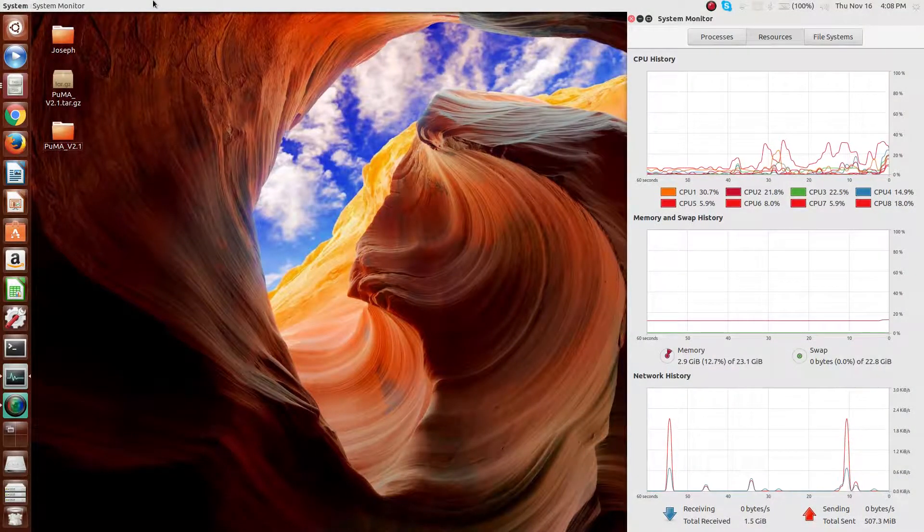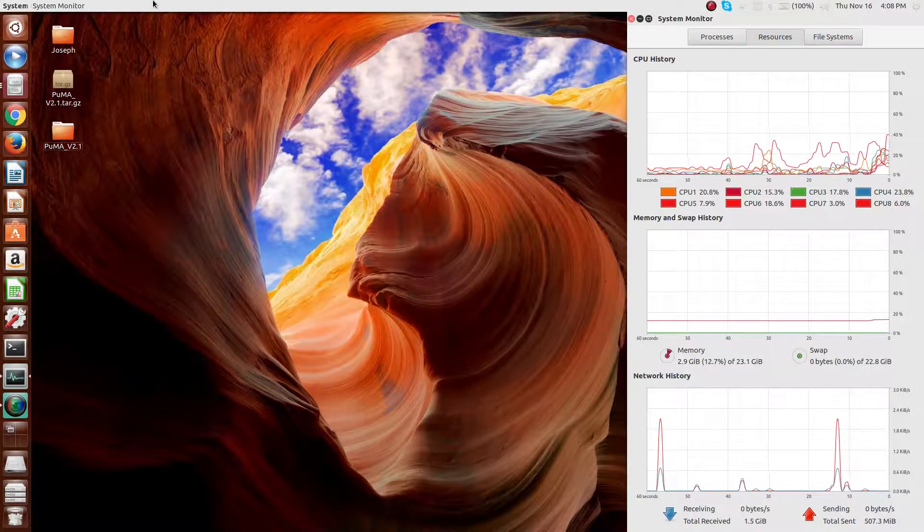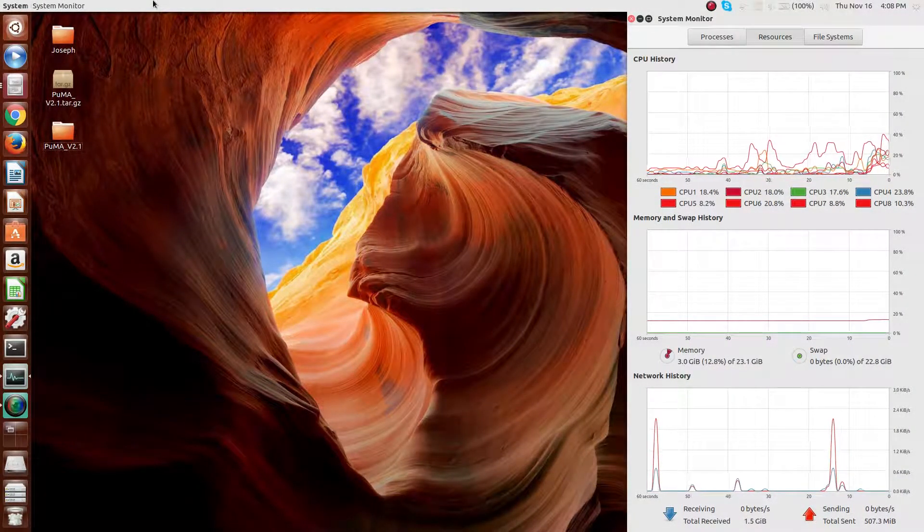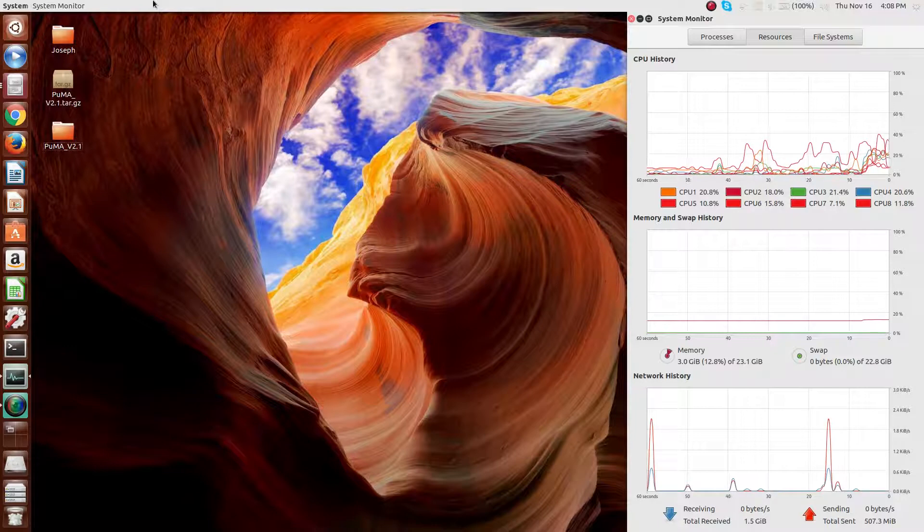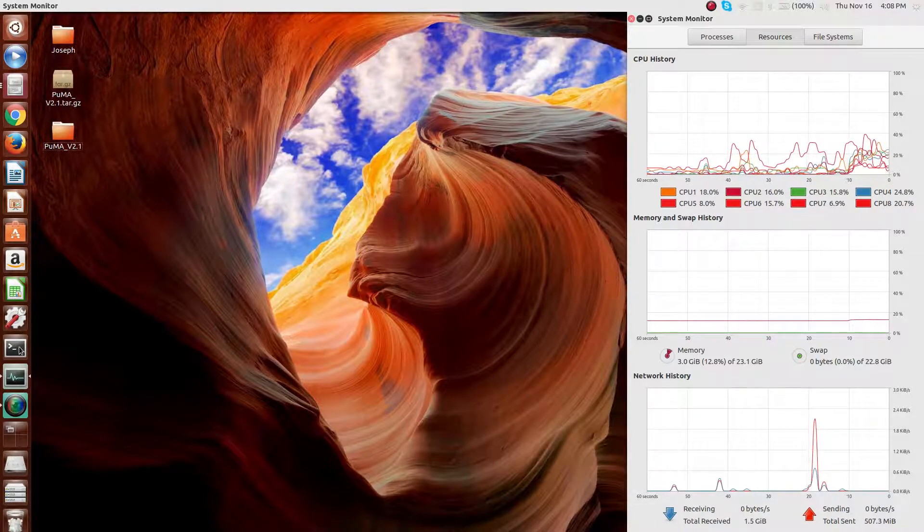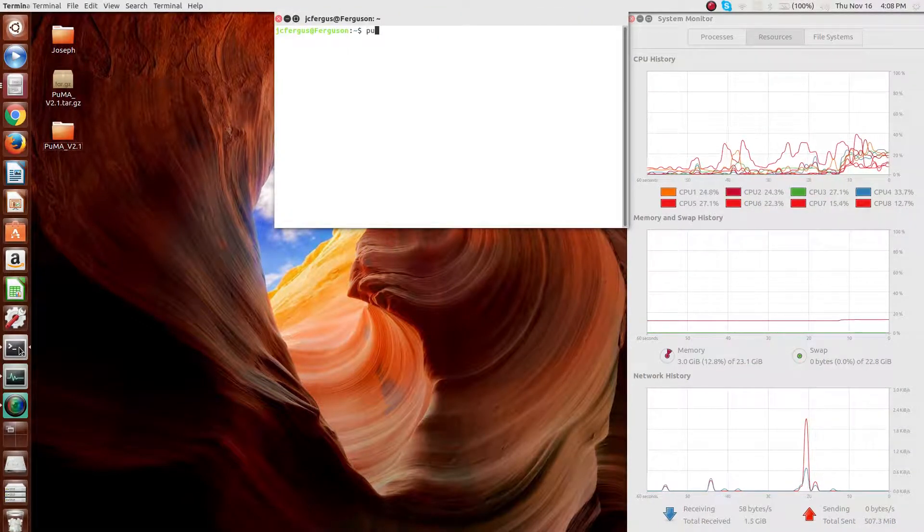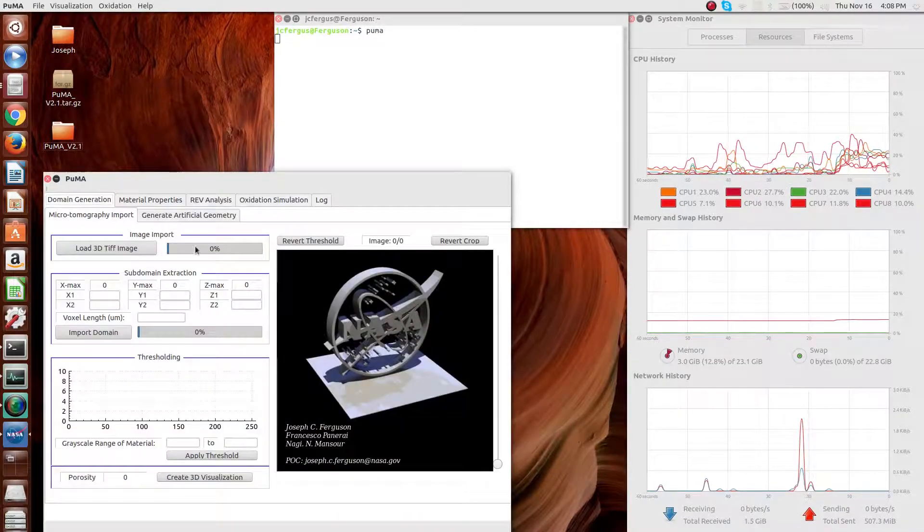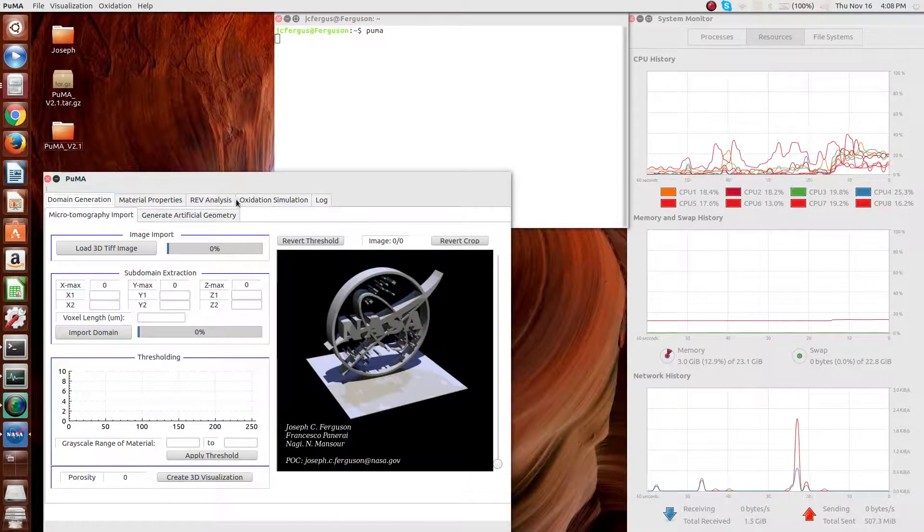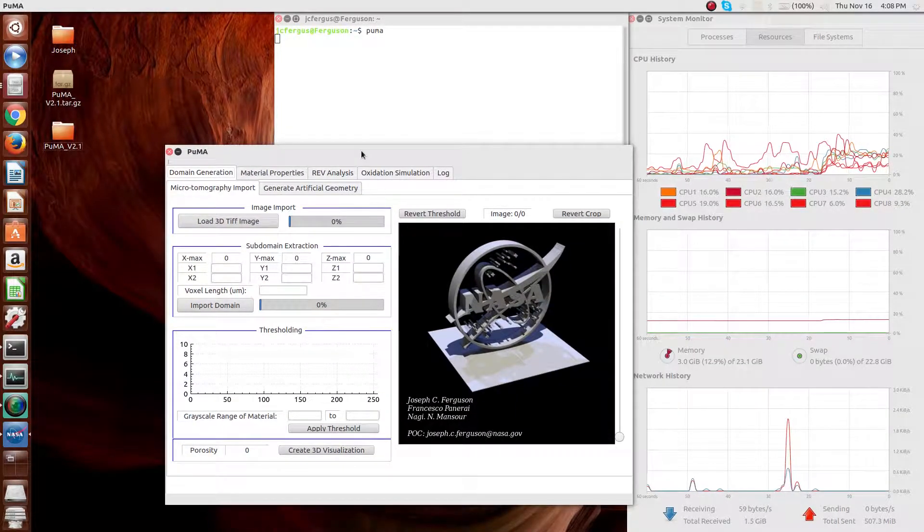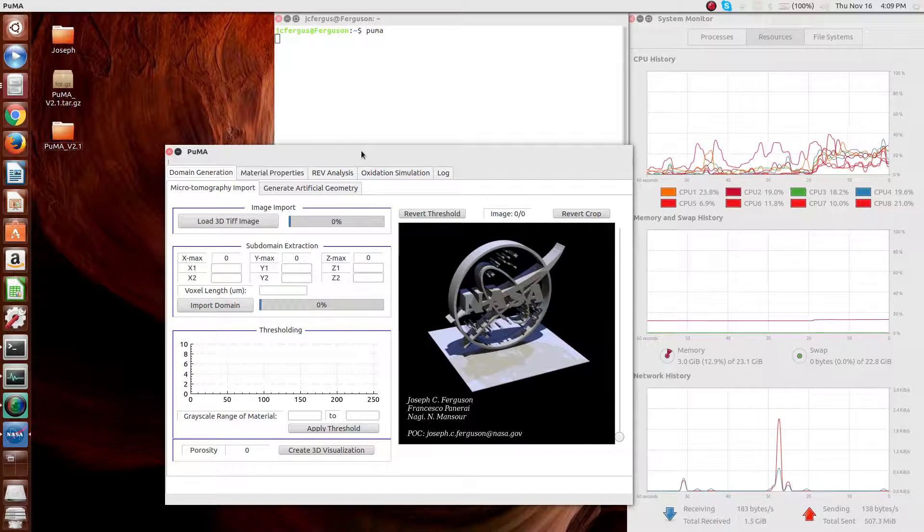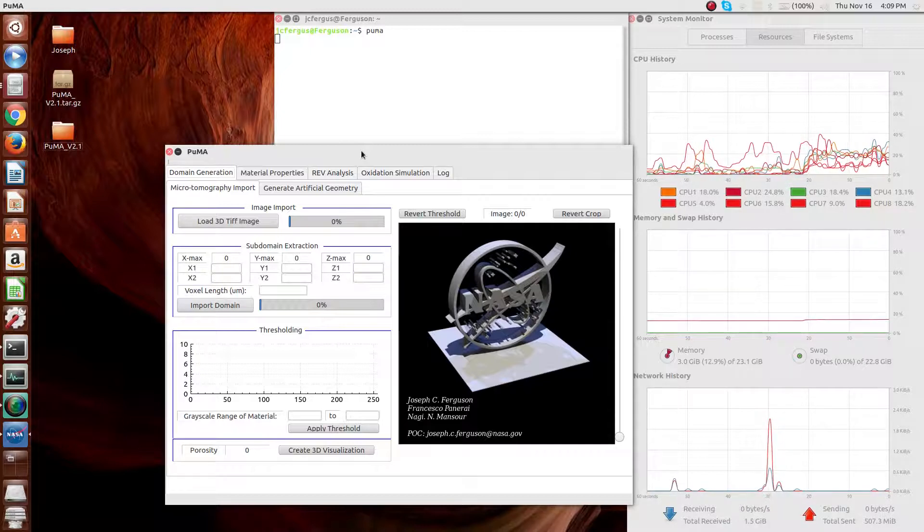In this video, I'll give a brief overview of the software in general and the various aspects of the code. As I'm sure you're aware, Puma is a software to do material properties and material response, as well as visualization, based on microstructures.